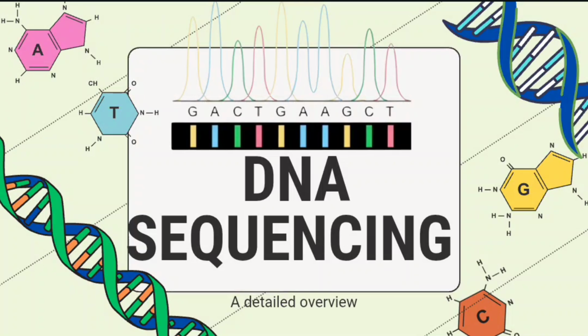In today's video, we will explore DNA sequencing, the powerful technique that allows scientists to read the exact order of nucleotides in our genetic code. From understanding hereditary disease to advancing personalized medicine, DNA sequencing has revolutionized biology and medicine. Stay tuned as we break down the methods, applications, and future of this fascinating technology in a simple and clear way.